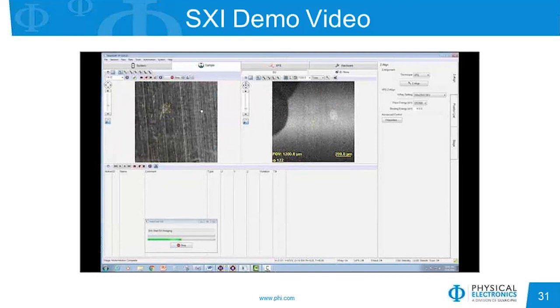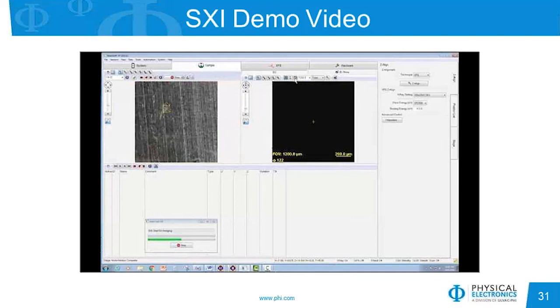We have the somewhat uniform area across the middle. We have a dark area to the left that corresponds to the bright area we see on the photo. And we also have a sort of white blotch, small spot on the right side. So each of these looked like they could be interesting areas to analyze.